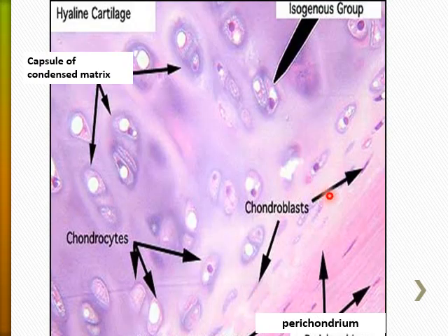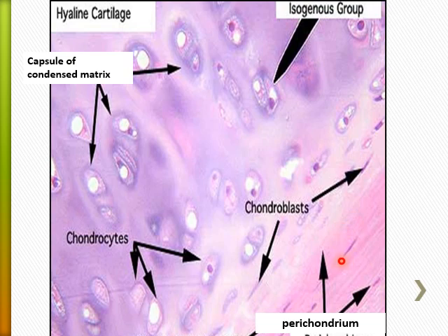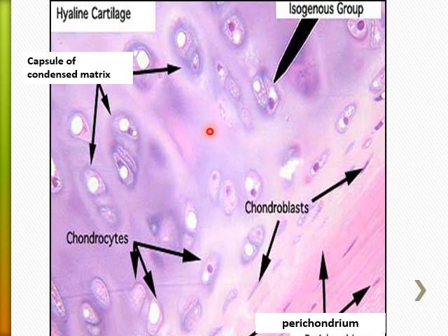At higher magnification, the hyaline cartilage is again surrounded with the perichondrium, formed of the outer fibrous layer and inner chondrogenic layer. Here are the chondroblasts, chondrocytes, and the chondrocyte inside a lacuna, dividing two to four or eight times, forming what's called a cell nest or isogenous group.